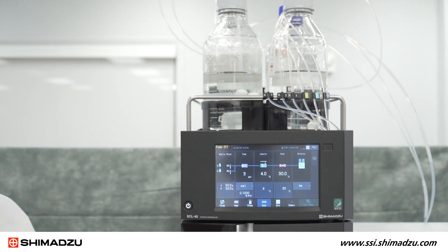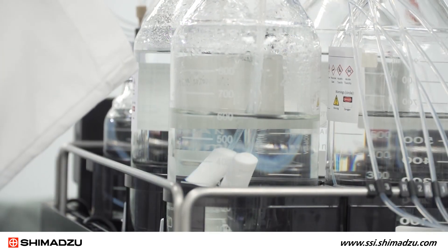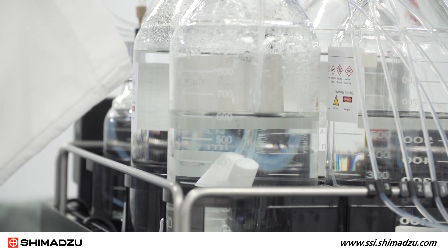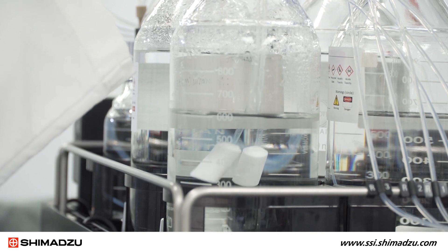Let's take a look at the Nexera XS Inert components. Here we have our SCL40 system controller that communicates between the LC system and PC. It also holds our mobile phase reservoir bottles. You will notice that ceramic suction filters are used in the place of stainless steel suction filters. Ceramic helps keep corrosion and metal ions away in the high salt and halogen concentrations.